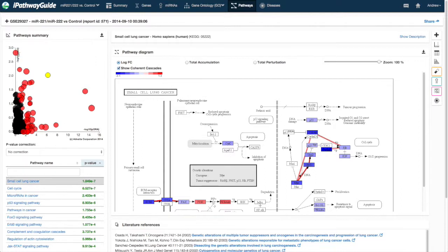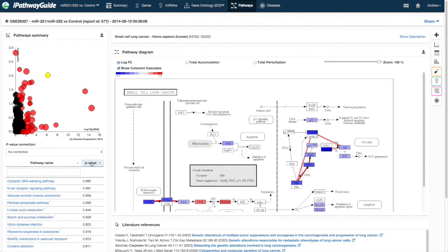The vertical axis shows the inverse log of the p-value for the accumulated perturbation of the pathway. This approach, called impact analysis, then combines the p-values into a global p-value, which is displayed in the table below.